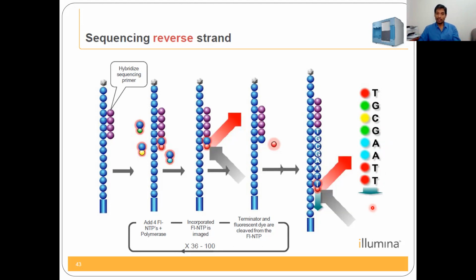Then when we are analyzing the data, we can use other tools, sequence aligning tools for paired end sequencing, and it will anneal the same sequences to understand whether there is an overlap or not. Sometimes there is a huge overlap, sometimes a small overlap.